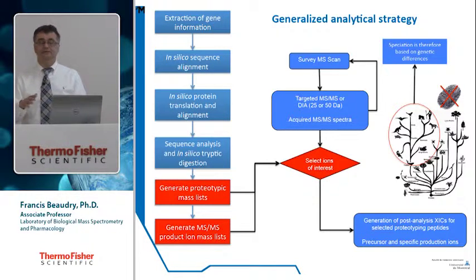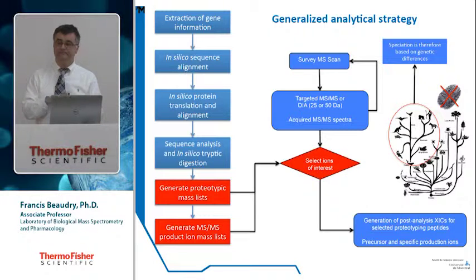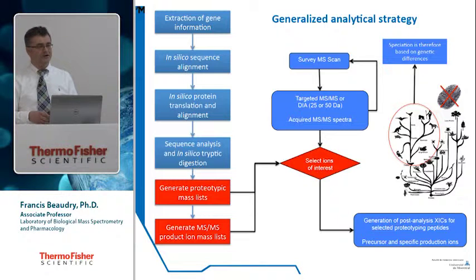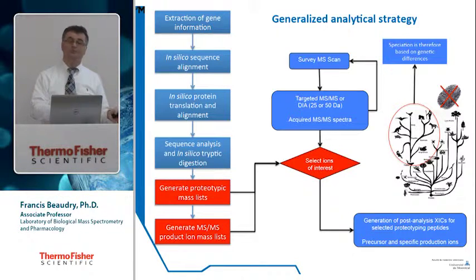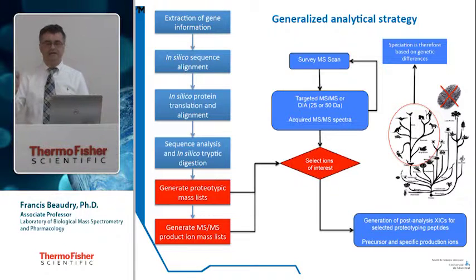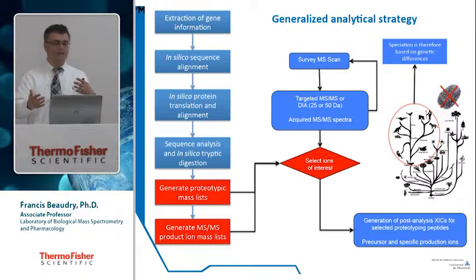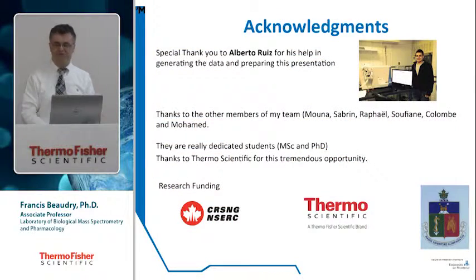Right now, the method can go down to 1% very easily. We've done it in the lab here without a lot of time, a lot of training. We did it once, it works, and we're very happy. In our lab, we went down to 0.2, 0.1%. But we think we can scale down very easily because we have protein. The quantity of protein is not limited, so we can scale down very easily. So we can have very sensitive methods using this strategy. That's what we think. So I hope it convinces you.